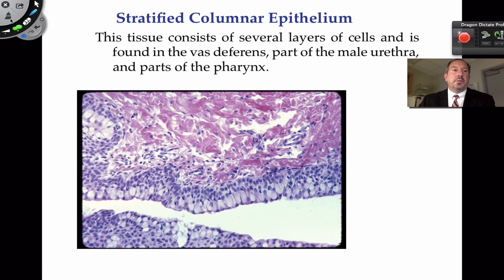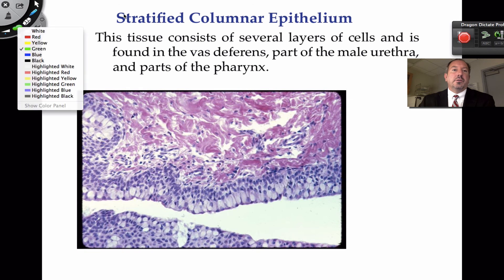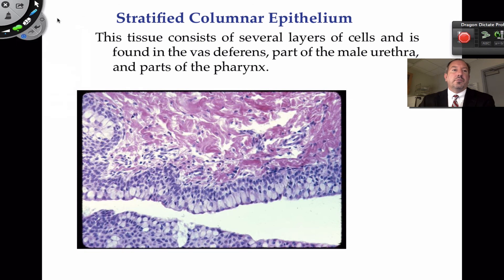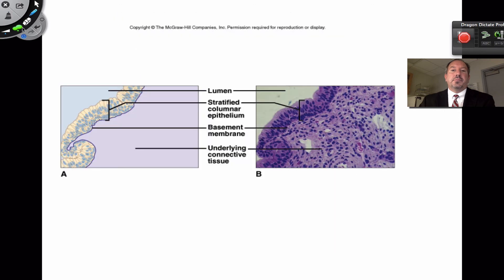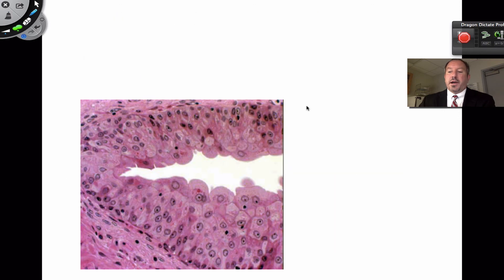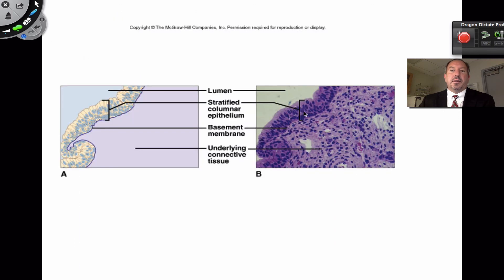So all of this tissue right here is stratified columnar, with something like connective tissue below. Here's another picture of stratified columnar right there.